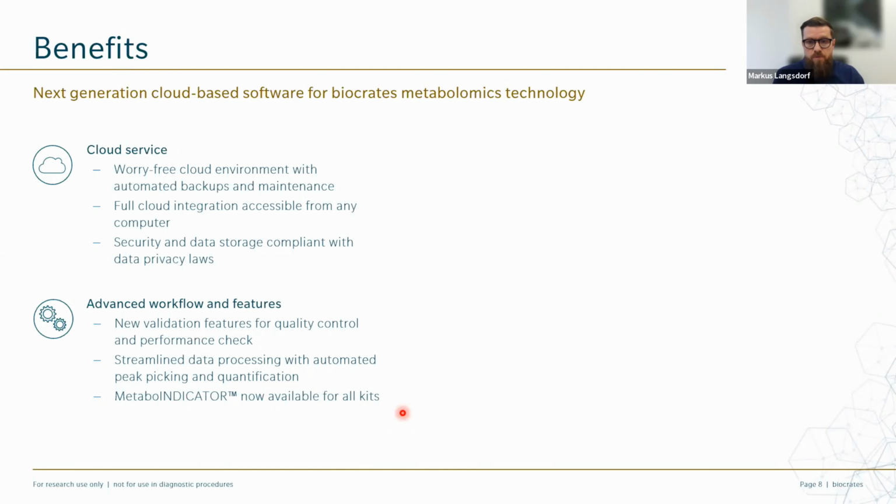These indicators can reflect enzyme activities and are connected to certain pathophysiological events, which helps researchers with regard to biological interpretation and to get insights into metabolic processes and pathways. A further benefit of the Metabo indicator is that it normalizes inter-individual variations and therefore increases the statistical power.